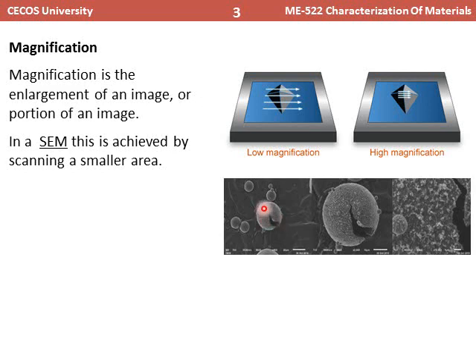If you want to scan this circular artifact, the electron beam has to pass over this small area to scan the image. So what you get is this, only a small part of the previous image.